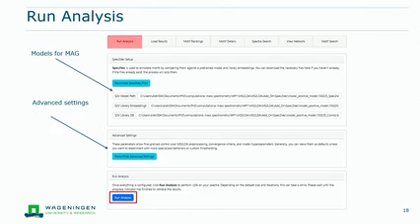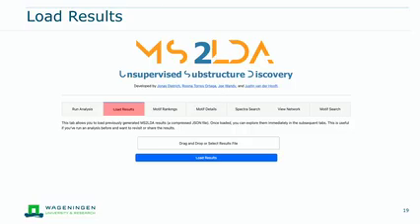Okay, then let's do something. I hope you can all see the load results webpage, or at least most of you. Maybe, can you confirm? Yeah. No, I think there are a few more. Yeah, it's probably not working for everyone. But so that we show some use cases, I would move on.